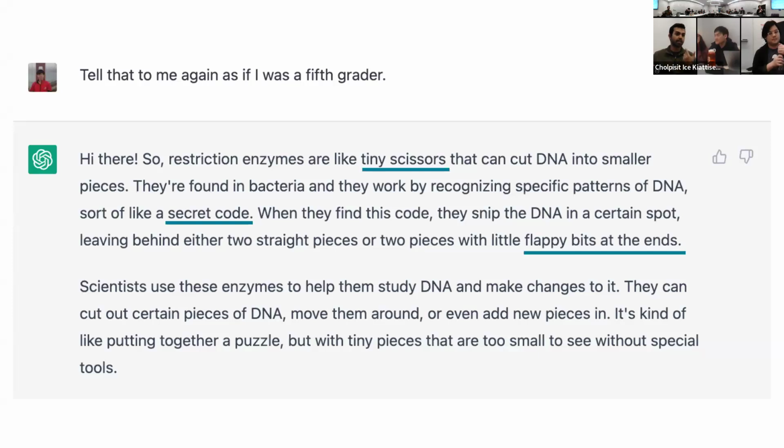And then this will be a staple technology and staple method that you use for a lot of your experiments in future labs. You've seen some of the other protocols. DNA gel electrophoresis is probably one tab of, okay, now conduct a gel. And so this is one of the very key processes. So any questions so far?